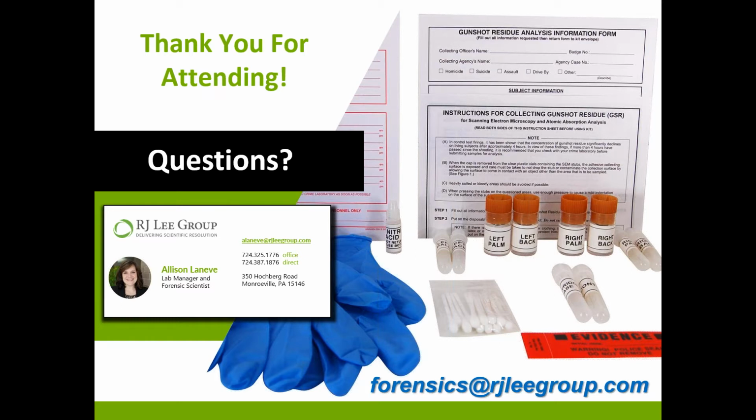If you are sampling from a vehicle, what areas should you sample from? That's another great question. Really, it's up to you where to sample from. You want to think about the areas that are going to be most probative to your particular incident or your particular case. So if you think that the person driving the vehicle is the one who discharged the firearm, then the steering wheel, the headliner, the inner door panel are all good options.